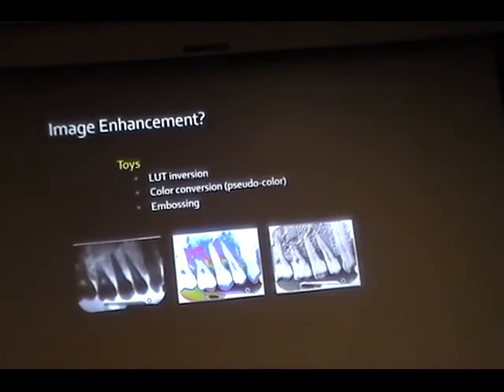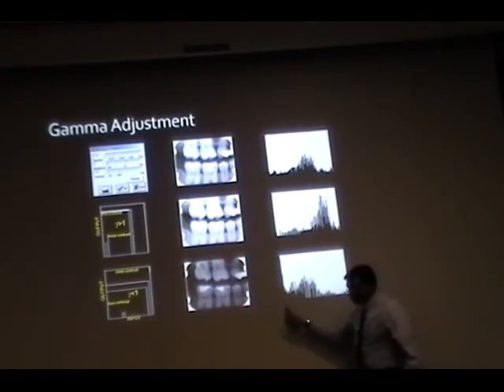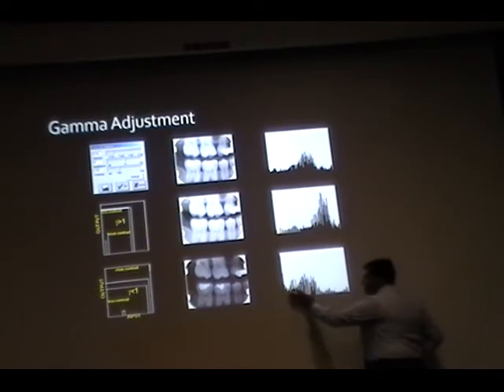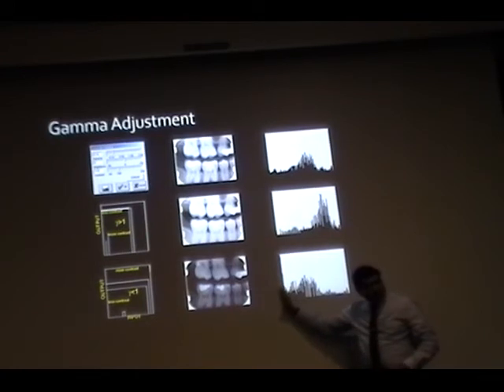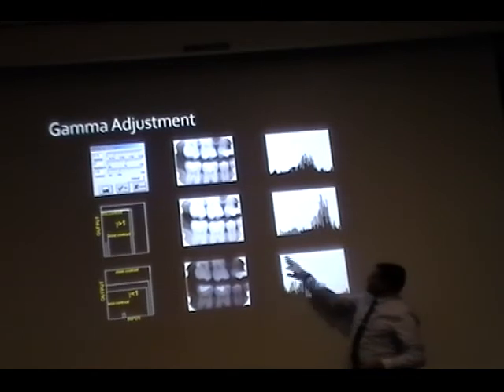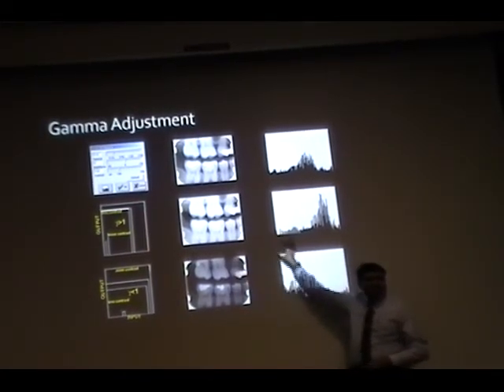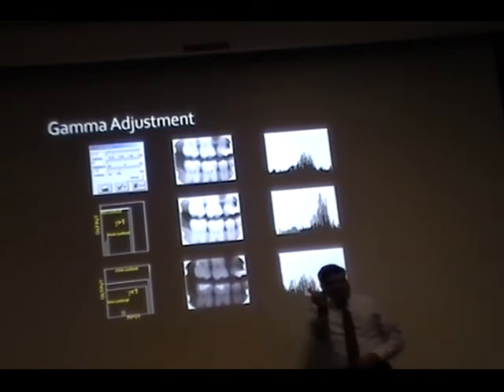What is this adjusting? Brightness? Yes. So for example, here is 0, the grayscales, and here is 255 or 256, that's the number. If you're looking at this graph, if it's closer to 0, that means the image looks pretty dark or black. If it is completely towards the 255 side, then it looks lighter. Using these as guidelines, you can change the image. You can pull the histogram and make adjustments.